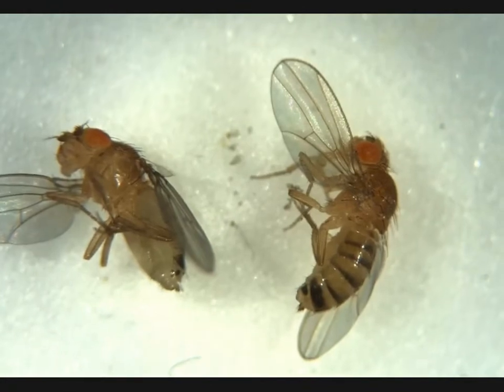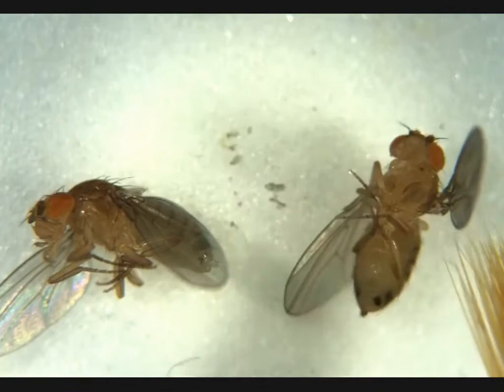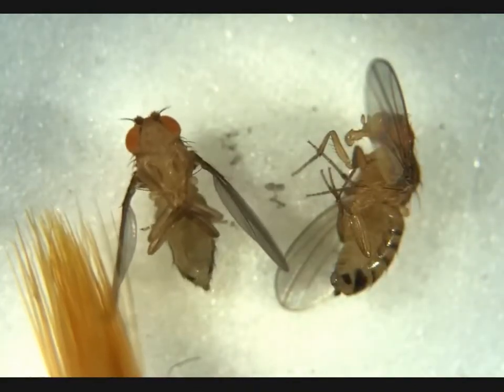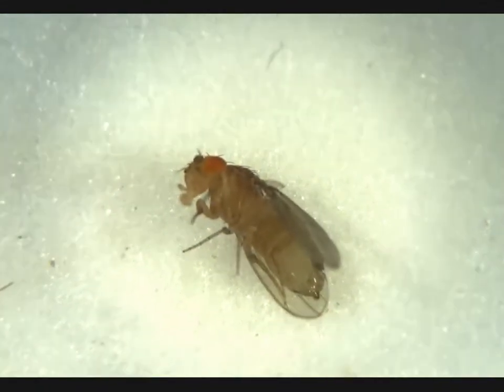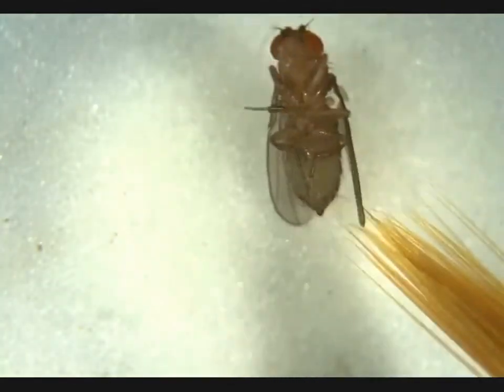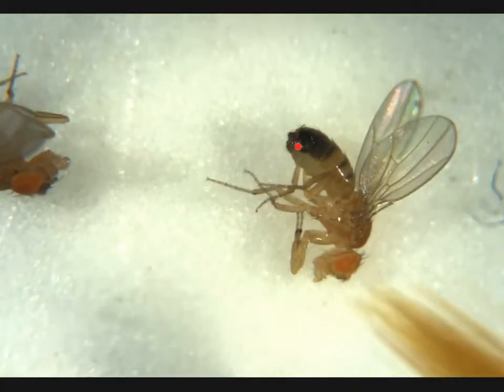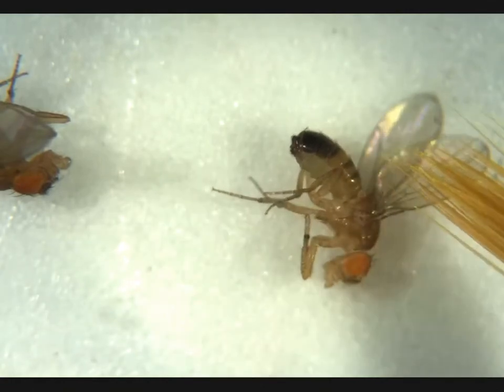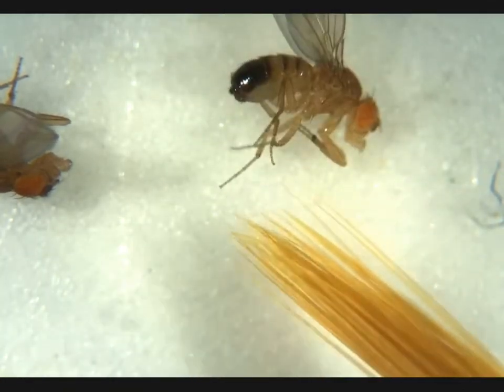We have two more females here. No penis apparatus visible on either of these, no meconium — so we're going to go ahead and say adult females for both of them. This is another female. No penis apparatus, no obvious meconium — she's an adult. Another male — banding here, all fused with a penis apparatus. No visible meconium — adult male.